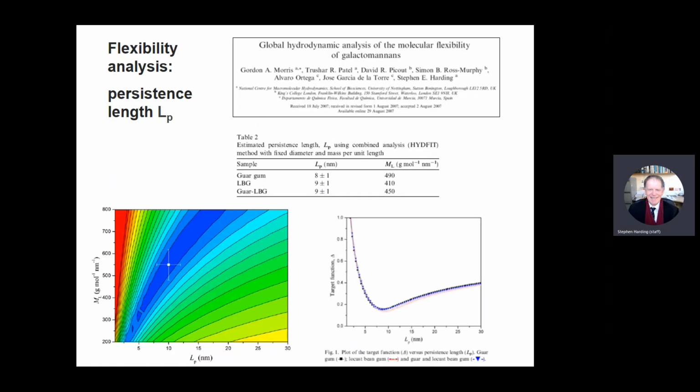And then to get a proper quantitative picture of the flexibility, this is again for linear types of molecules, you measure the persistence length.